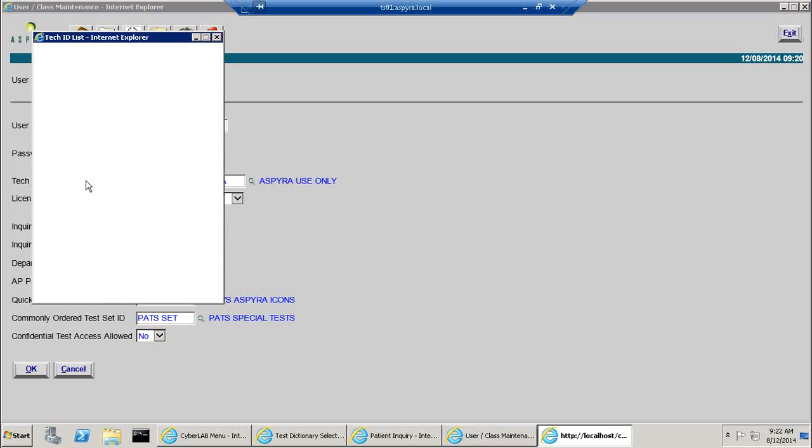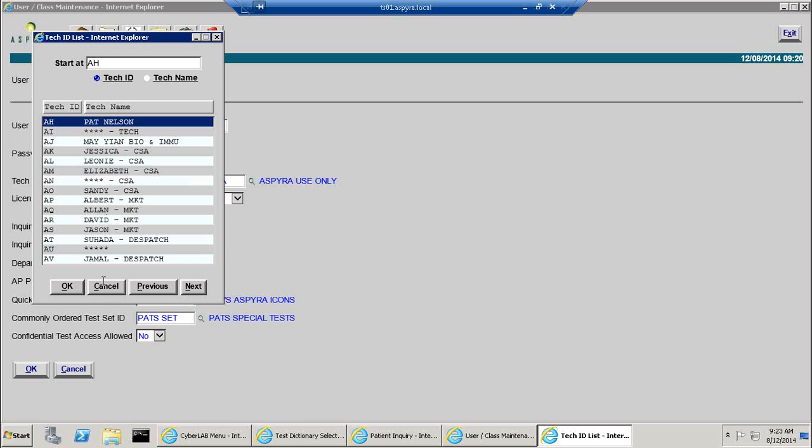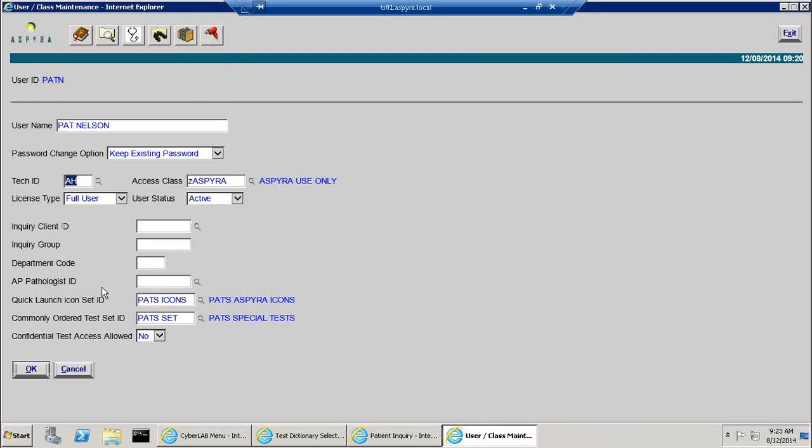The user class maintenance per se was very, very limited. Basically it limited you to being able to access a particular menu. You weren't able to have any control over who was in the menu, or what you could do when you got there. There was even some limited control over what you'd done, and it was all controlled in the background by someone from Spira.